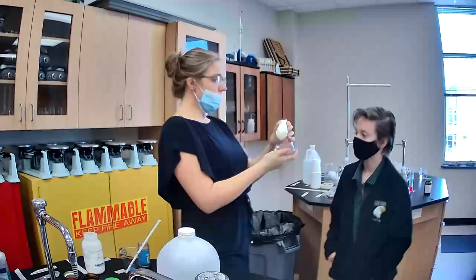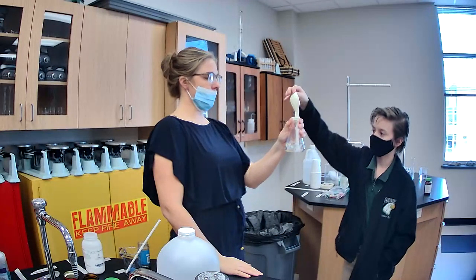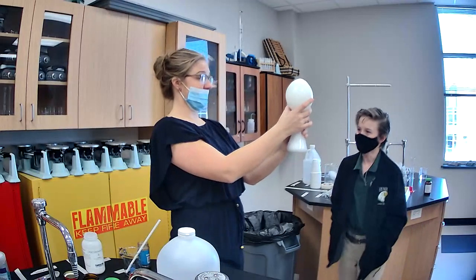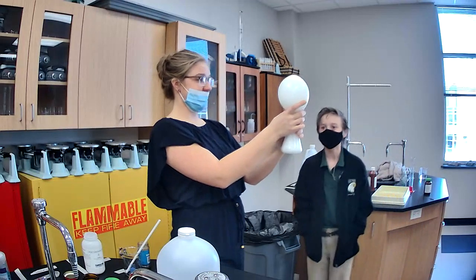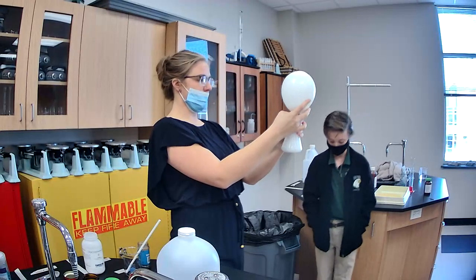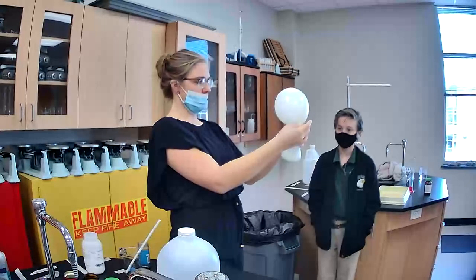When you're ready, just take the balloon, tip it up. Whoa! Whoa! Whoa, it's filling up.